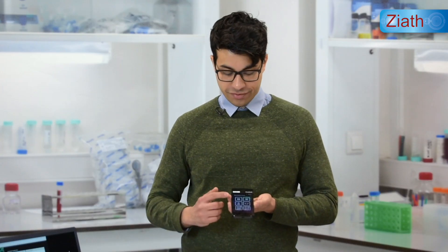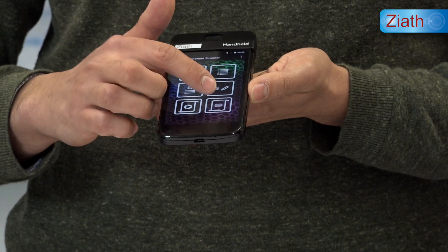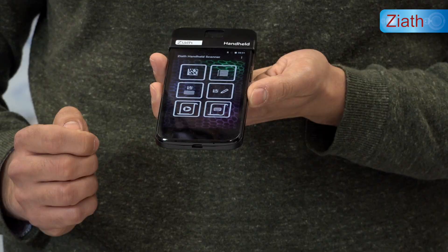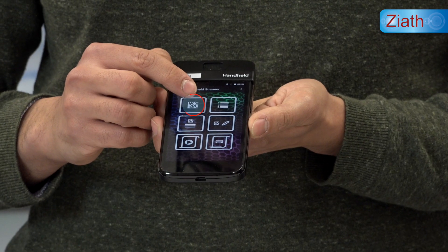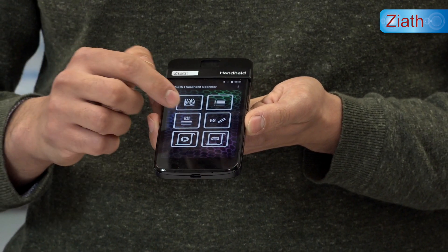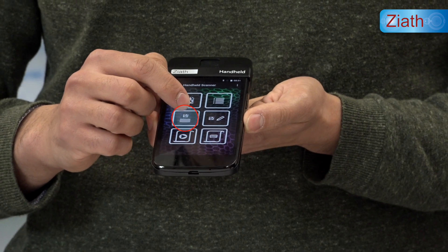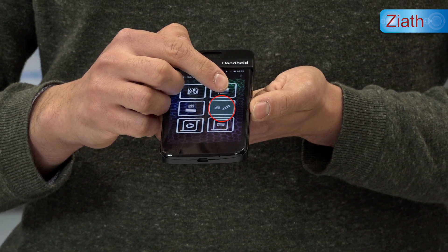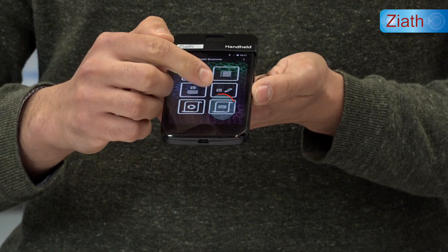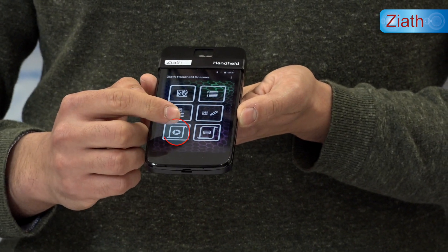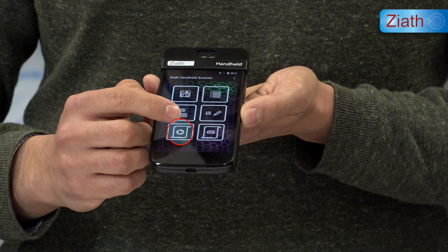On screen you can see the five features of the handheld client and the handheld server shown in the bottom left. To explain each feature one by one: we have the simple scan mode, the pick listing function, the sample lookup function, the add and edit sample data, and at the bottom the keyboard wedge. The handheld server opens up the handheld scripts.